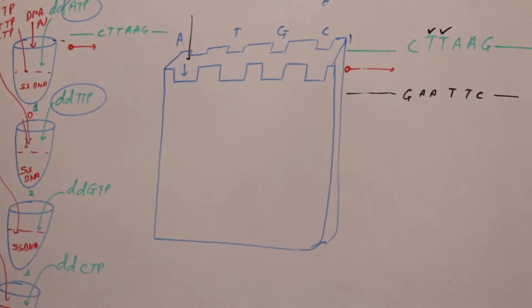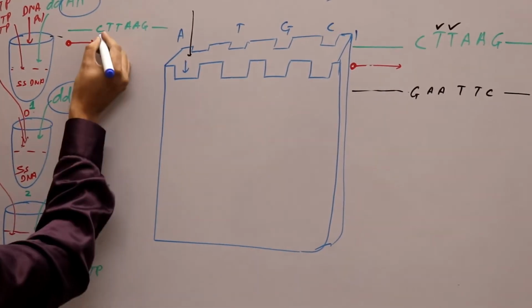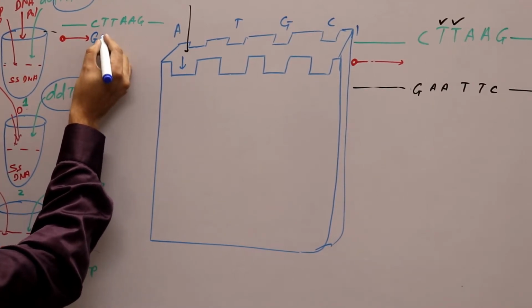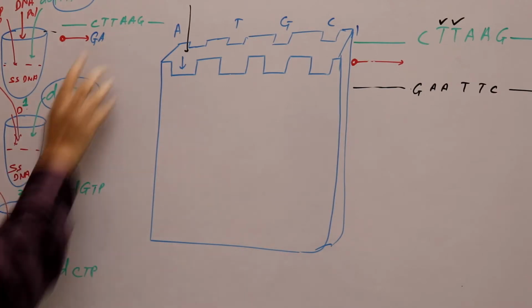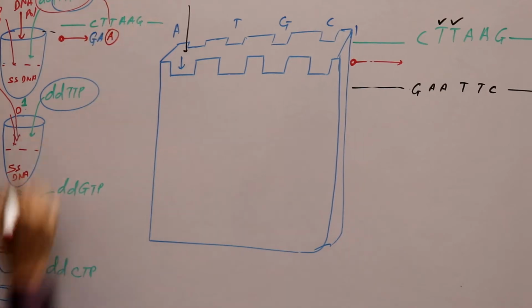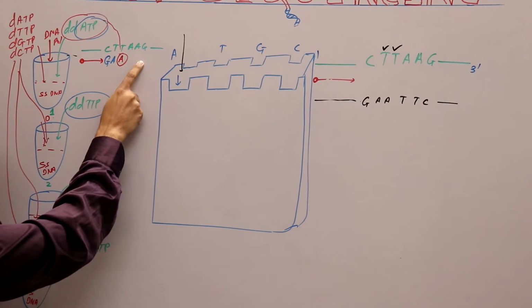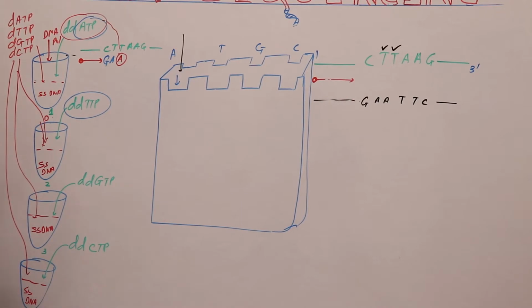Okay, now listen with all your attention possible. Now, DNA polymerase has already started working. That means, what will be incorporated here? Opposite C is G. Opposite T is A. Now listen, the third, again there will be A, right? Now suppose the third A is actually ddATP. That means after that, no nucleotides will be allowed. Listen with all your attention.